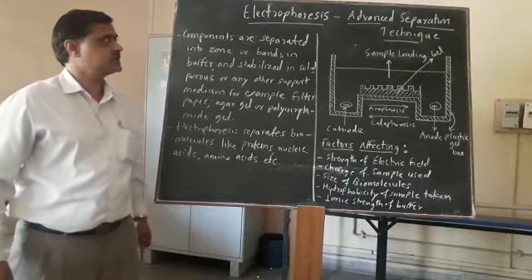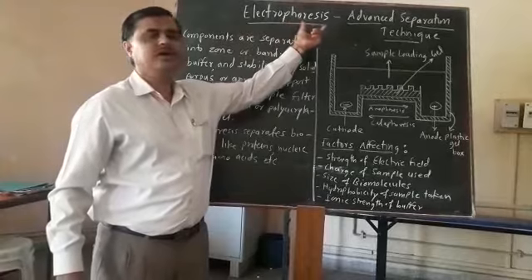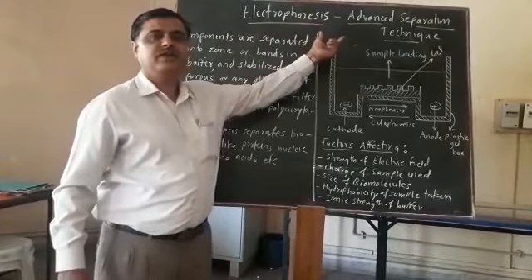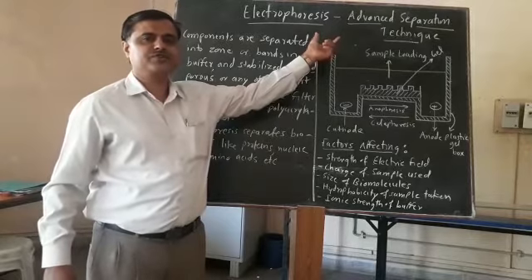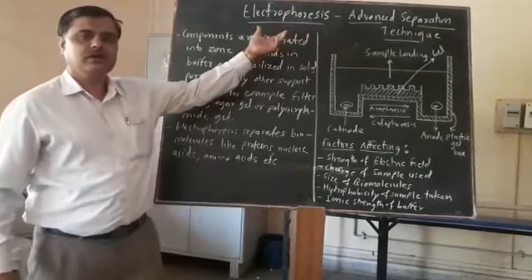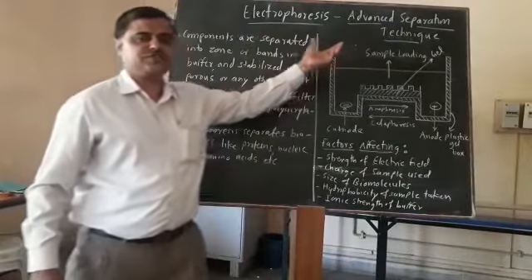We are going to discuss the electrophoresis technique. This is one of the advanced separation techniques for the separation of different components. This is under the subject of advanced separation processes.